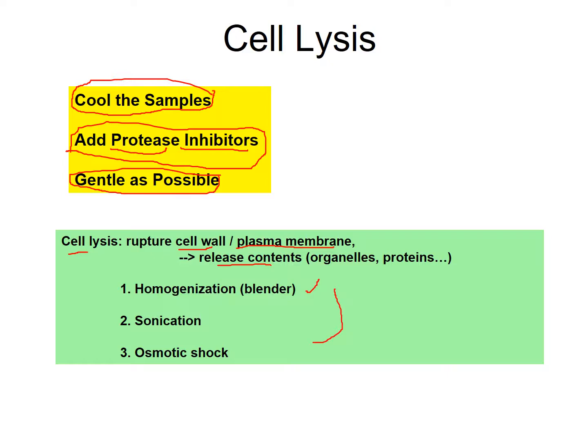And in cell biology, you're saying, well, why don't you just have the one? Because it's empirical. Empirical means that it's usually done by learning. So a cell from an organ may require a different process, a different outline to deal with. So sometimes you read the literature, go to PubMed, and search liver cell lysis versus, say, muscle cell lysis.